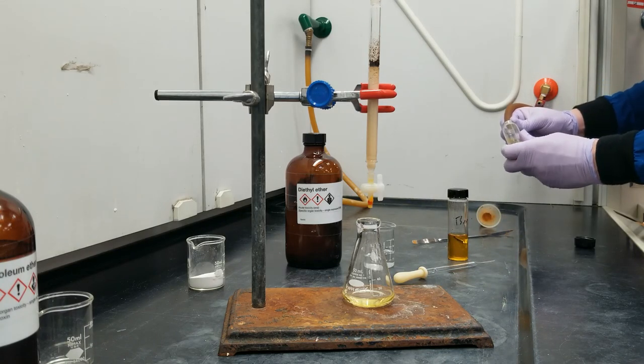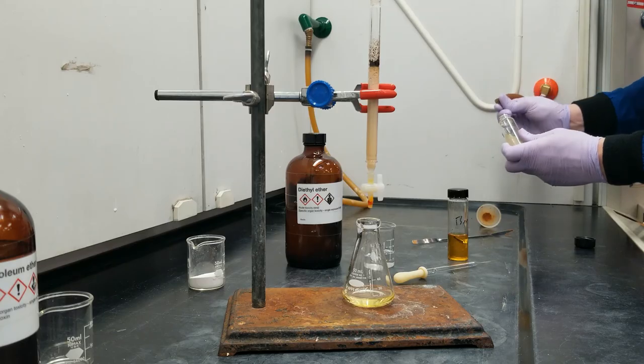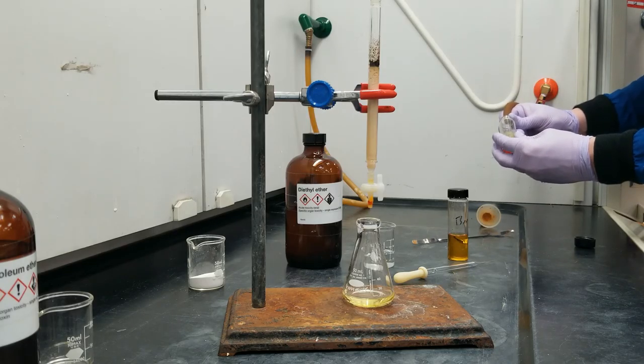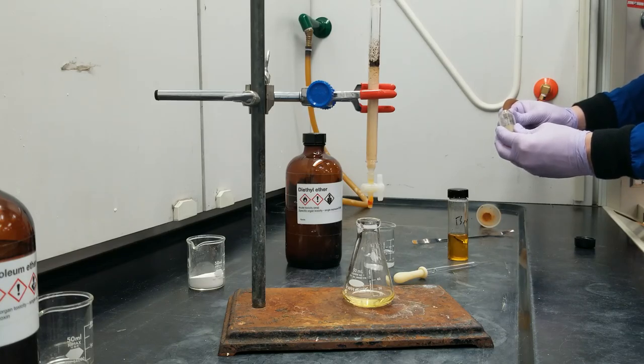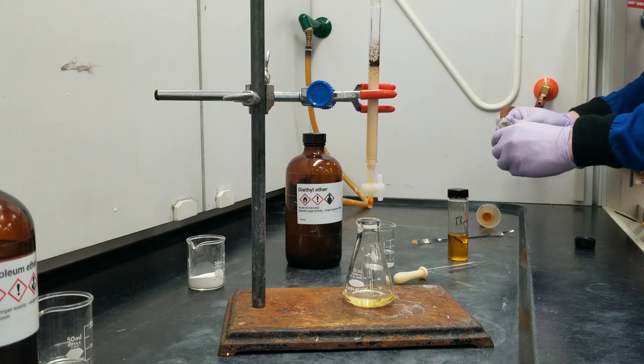So, this is what it looks like to remove a solvent by airstream. I have a little air hose here, which I'm pinching just like a garden hose to get a little bit more pressure. And I'm just blowing air across the solvent. And it's actually really important that I hold the solvent in my hands here, because as it evaporates, the solvent gets really, really cold, which stops it from evaporating. So in order to continue effectively evaporating the solvent, I need to warm it up with my hand.